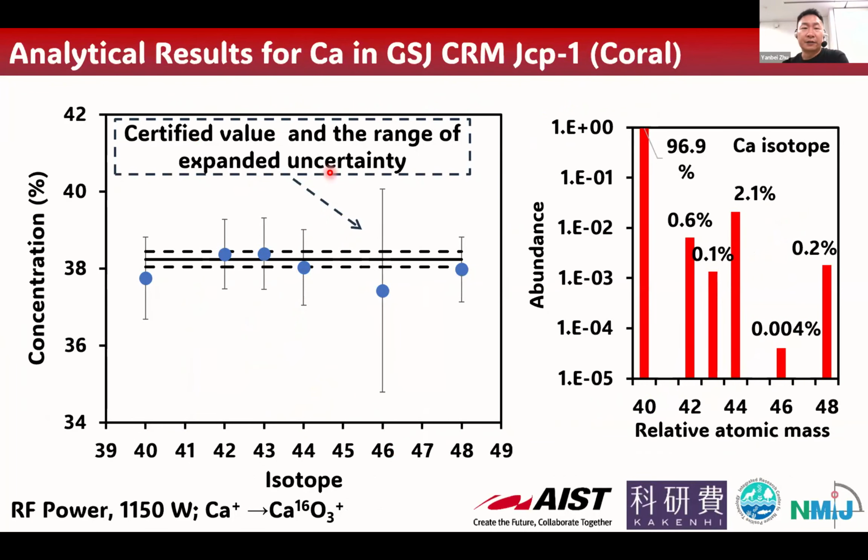So this permits us to measure each calcium isotope, including calcium 40.